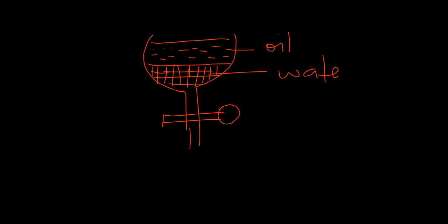Now, all I would have to do is to regulate the tap. Even before I do that, I can put a little container here to trap whatever comes out of the funnel. Then I can regulate the tap in such a way that the mixture in the funnel flows in droplets. It will come in droplets, so it will be easy for you to monitor whatever comes out. So you are making them come in droplets.